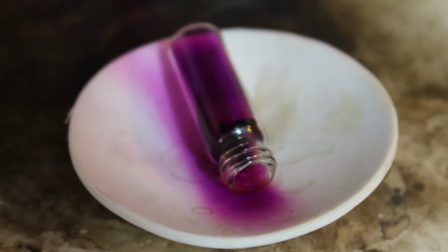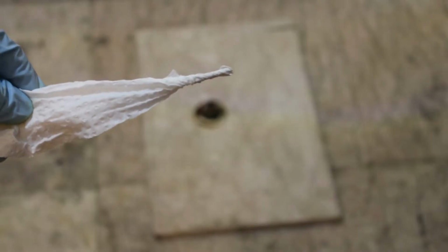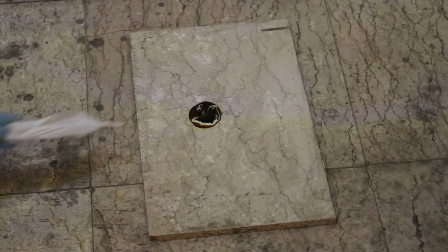And now to make nitrogen triiodide, the contact explosive chemical. Its instability is so great that it literally explodes with the touch of a Kleenex.